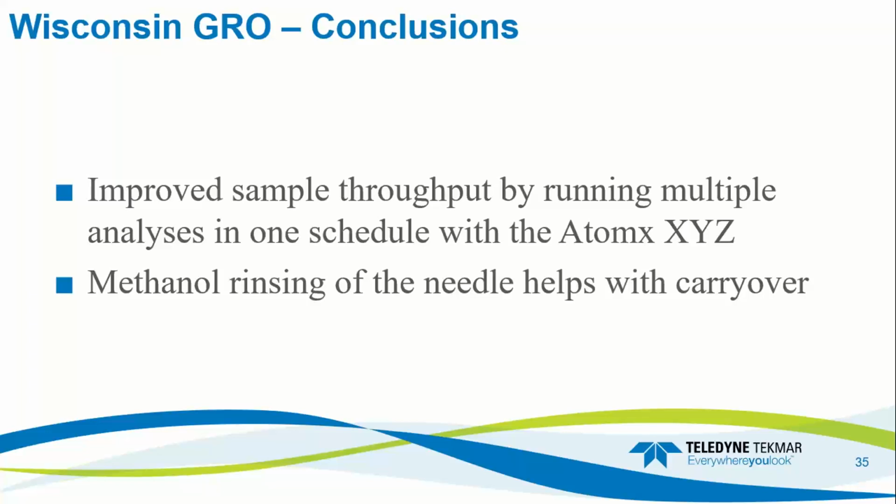We ran a midpoint verification check with precision and accuracy for the water method at 20 ppb, and it displayed a 4% RSD for all compounds and an average recovery of 109%. We did the same on the soil side with 20 ppb soil samples, and we saw a 4.3% RSD and an average recovery of 95%.